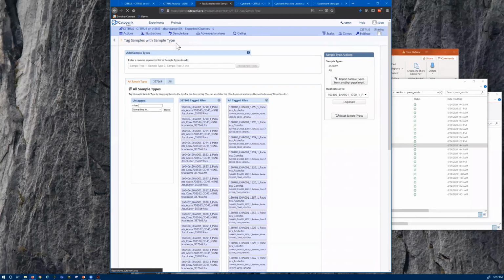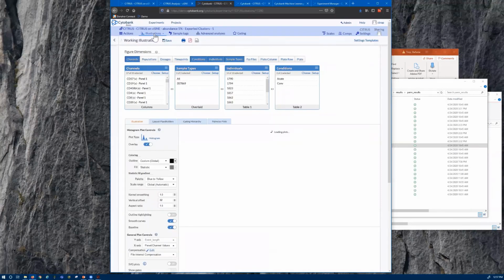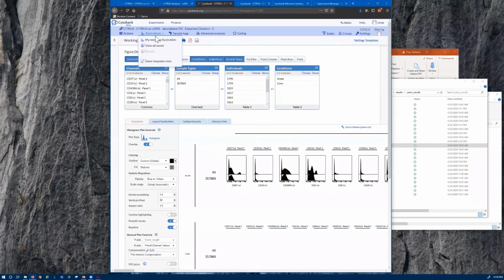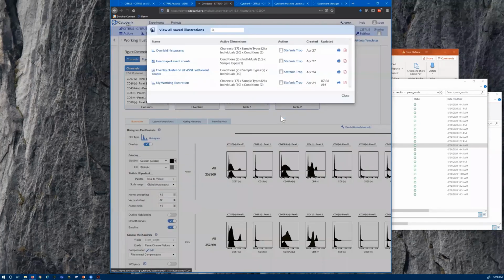Okay, perfect. Thank you very much. Okay, we have another question, a really good one. What are the limits on the number of channels and features that can be analyzed in Citrus? This is with regards to AbSeq or CiteSeq experiments with more than 100 features, or even with respect to RNA-seq data. And Jiho, do you want to answer this one?